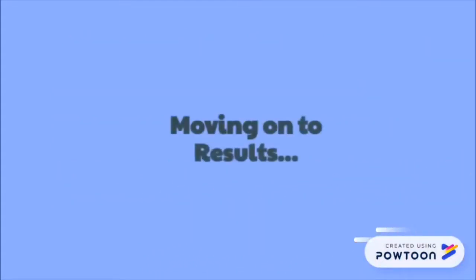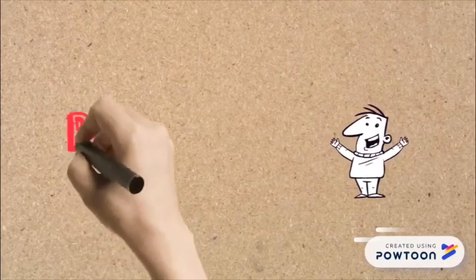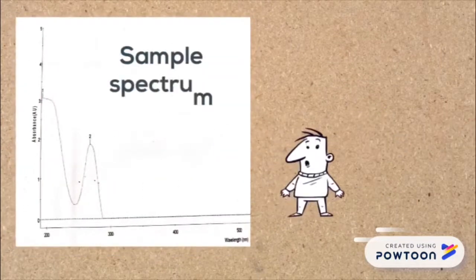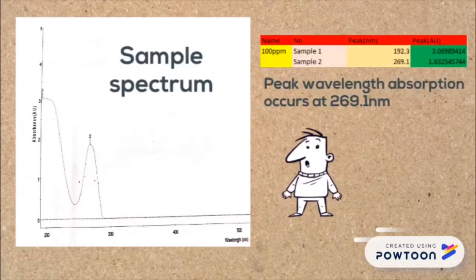So, moving on to results. Let's discuss the results of this experiment. The results are based on Beer-Lambert's law. As can be seen, a sample is measured under the instrument before calibration. The observed peak absorption of the caffeine sample occurs at 269.1 nanometers.